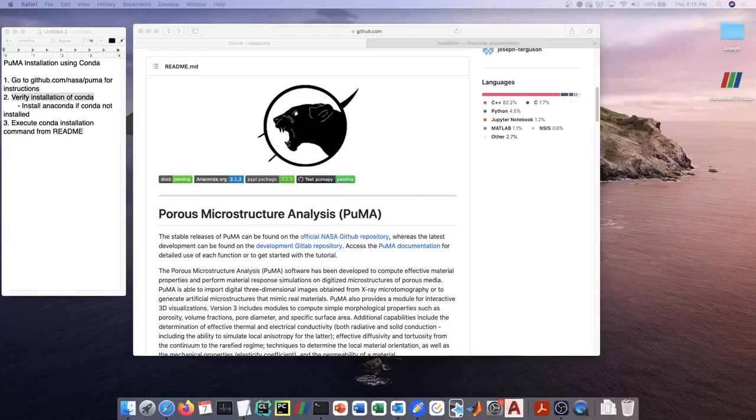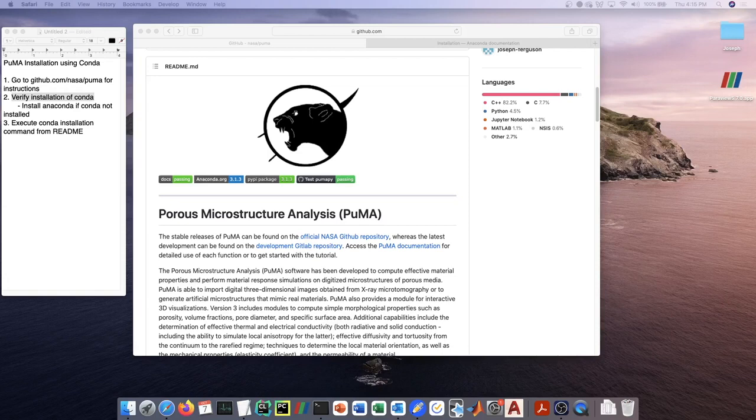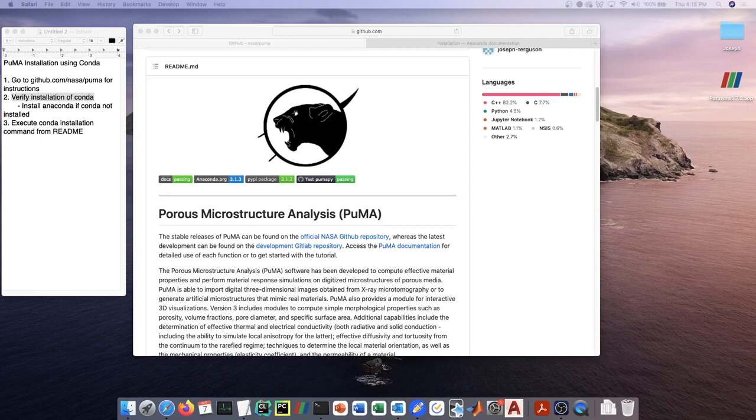This tutorial video is going to go through the installation of the Porous Microstructure Analysis software, or PUMA. PUMA is a software to do material response simulations or material property calculations based on a material's microstructure, typically to extract effective material properties from x-ray microtomography imaging.